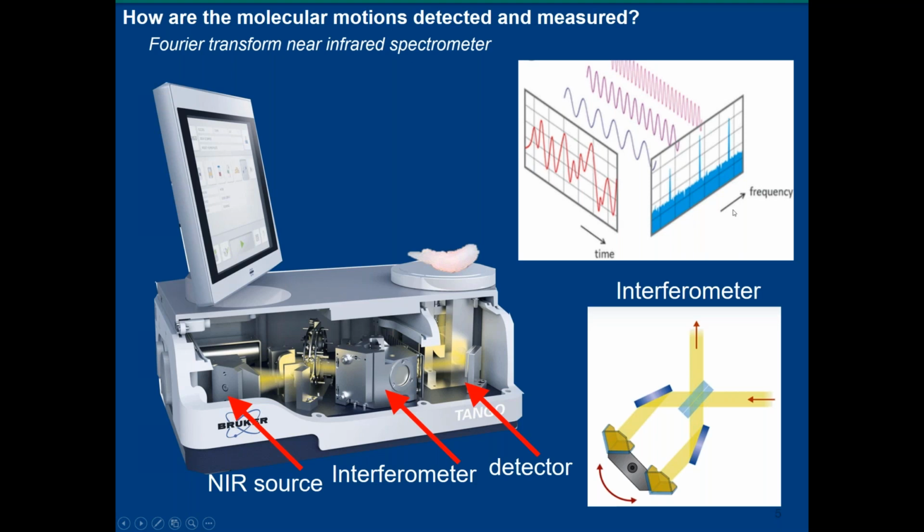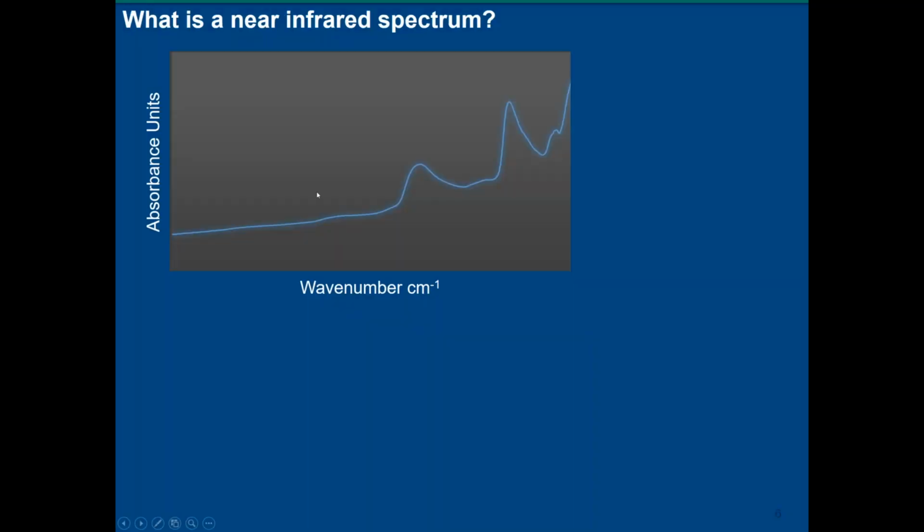to initiate those vibrational responses. So the Fourier transform process of this is actually a transformation to collapse the time domain into just the frequency domain, and that's what we're interested in learning about or identifying with regard to the importance of, say, what frequency response is related to the target structure like the otolith. Ultimately, what we get in the frequency domain is absorbance units that are related to the vibrational response by wave number. This particular absorbance spectrum is actually a fingerprint of the target structure that we just interrogated. And each of these measurements actually occur at a 1 centimeter wave number. So potentially we have from 12,000 to 4,000, or actually 8,000 measurements of the absorbance profile per channel or single wave number.